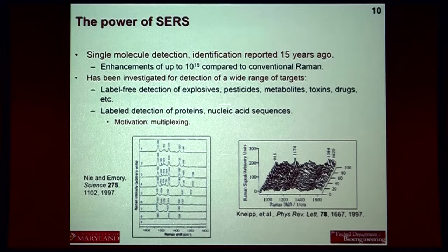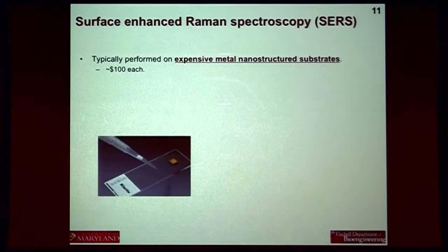And in reality, just as kind of an informal side note, of course we want to compare SERS with HPLC-MS just because I talked about it. Reality is HPLC-MS will always be more sensitive and will always be more specific. So from my perspective, the only way that SERS is really going to get out there and going to get used is if we take it out into the field where we can't take HPLC-MS. It's never going to replace it. So that's really where my focus is. So let's see if everybody else has the same kind of mentality as I do anyway.